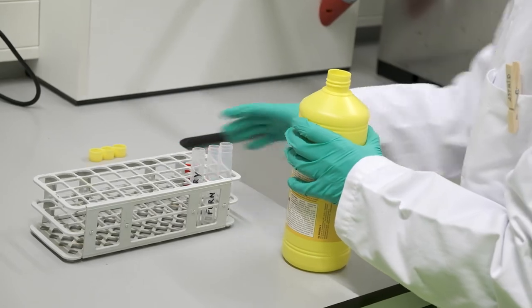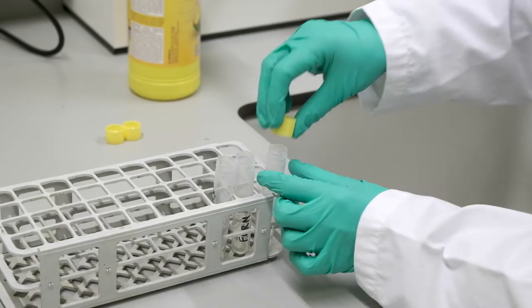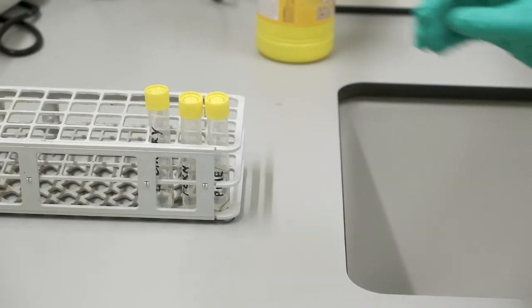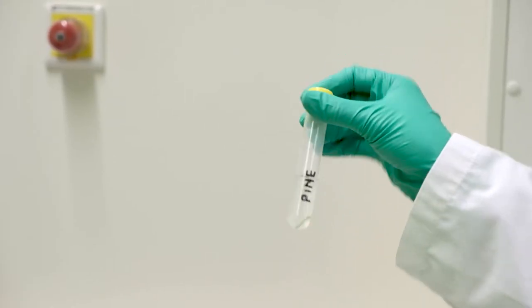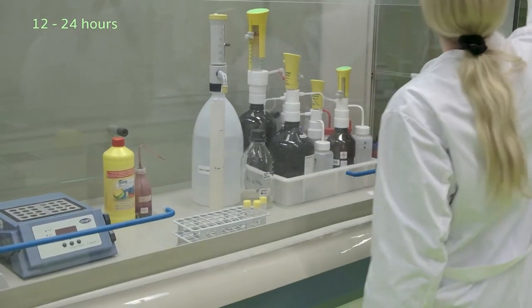And then you put it in bleach in a test tube, and it will bleach out the mesophyll cells, and you leave it for 12 to 24 hours. It depends a bit on the leaf, how long it needs. So it's a bit trial and error and different between how thick your leaf is.